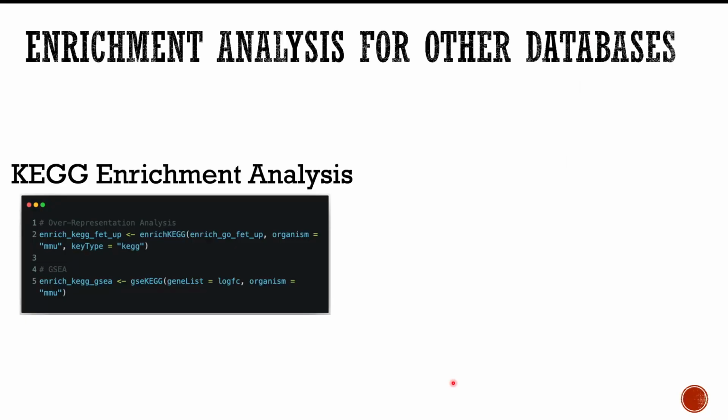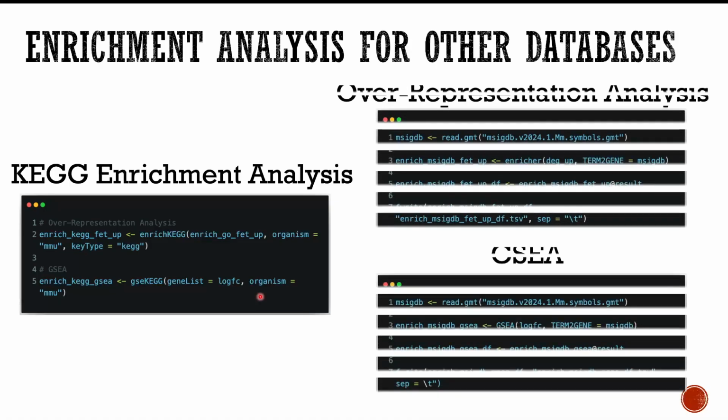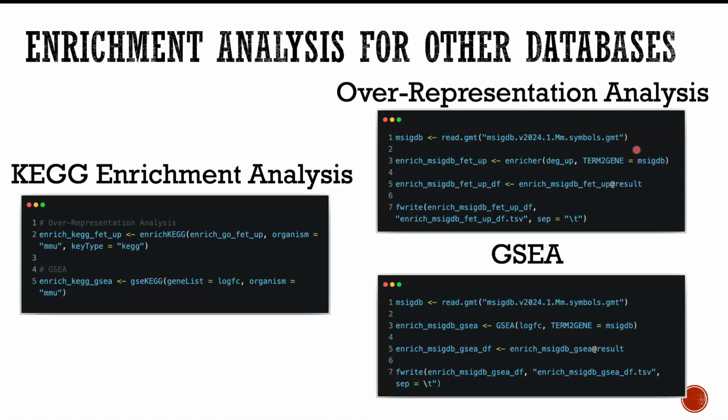There are also functions specifically for KEGG enrichment. So for example, for ORA, we use enrichKEGG, and for the GSEA method, we use gseKEGG. So how about other pathway databases? Well, there's a way you can query your DEGs against all the pathway databases.